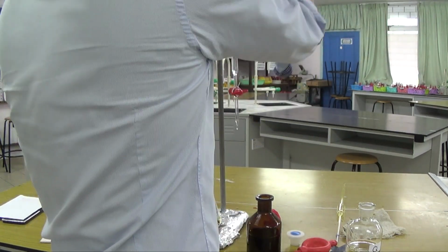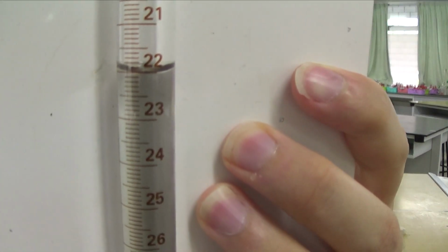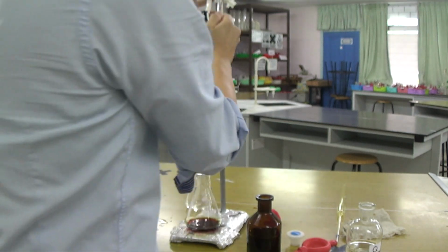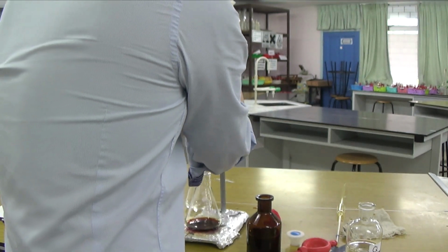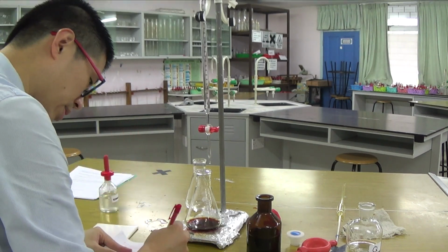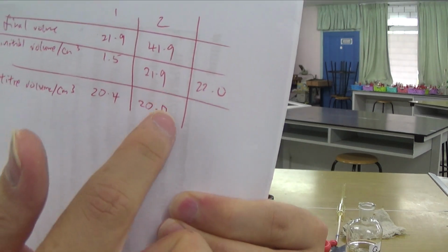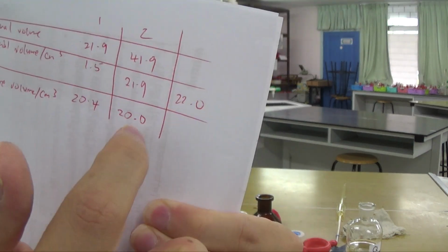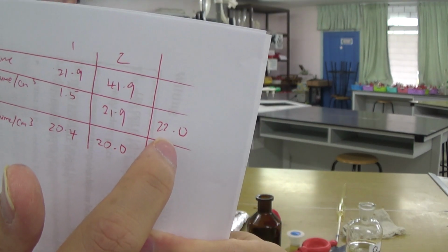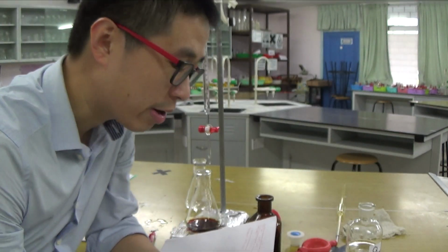Okay, where do I start? I start from 22.0. So don't have a white tile all the time, but I start from 22.0 cm cube, give or take. So my third titre should be the same as the second because I'm a competent chemist. I'm expecting plus 20, so that should be 42.0, because of the 1 decimal place accuracy of burettes.